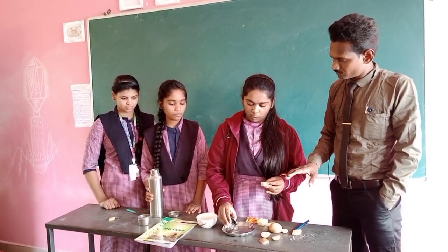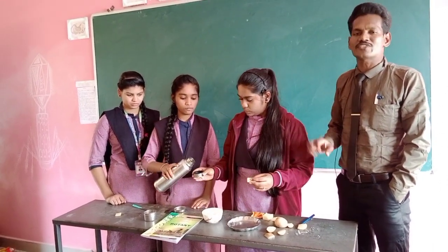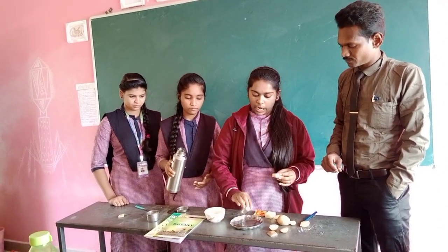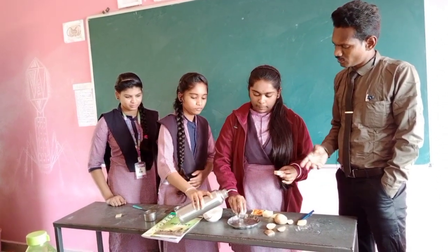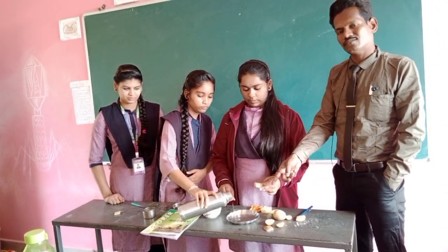we have to place some normal water in it. Normal water means lower concentrated solution. Normal water we have taken.